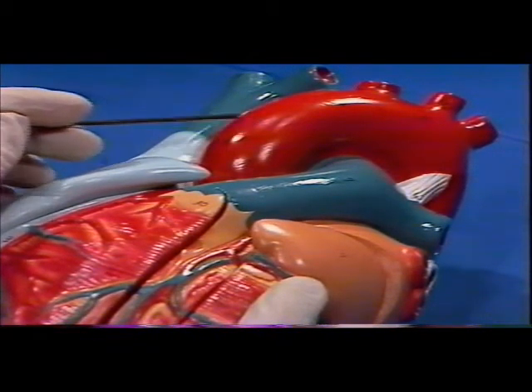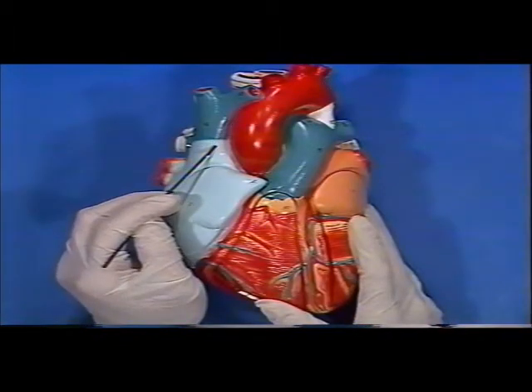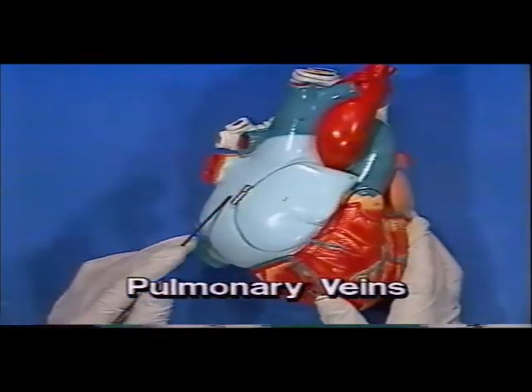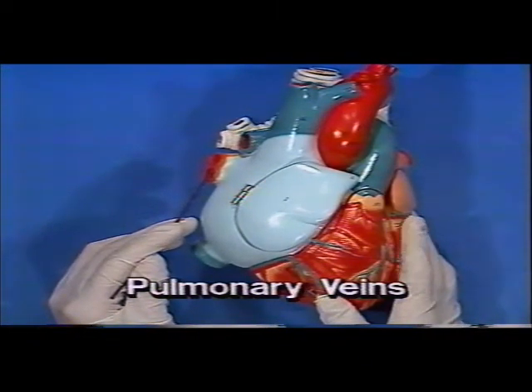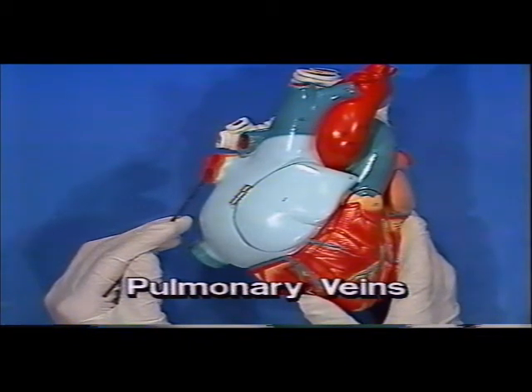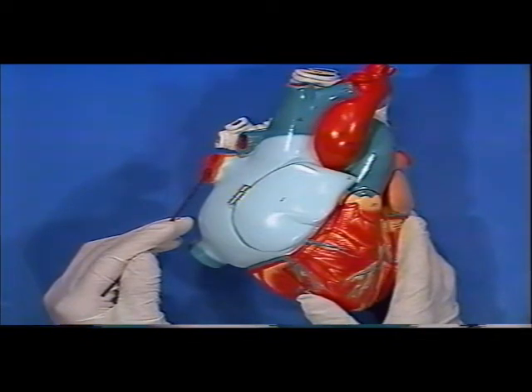The position of the vena cava, which empties into the right side of the heart. The pulmonary veins return oxygenated blood to the left side of the heart. They can be seen at the base of the heart, that is, the posterior surface. The great vessels are often damaged when the heart is removed from an animal, but there may be some remnant of them on your specimen.